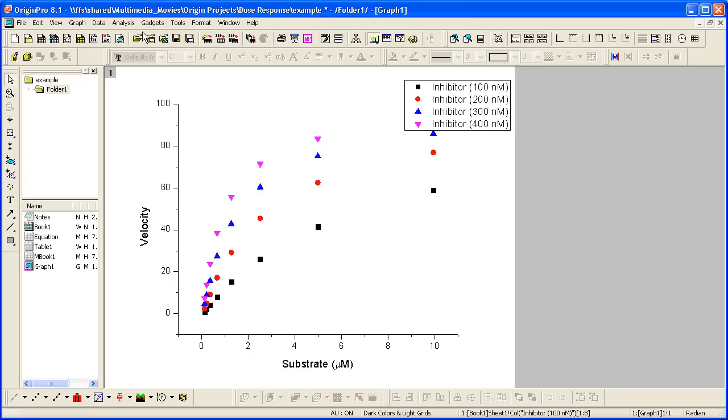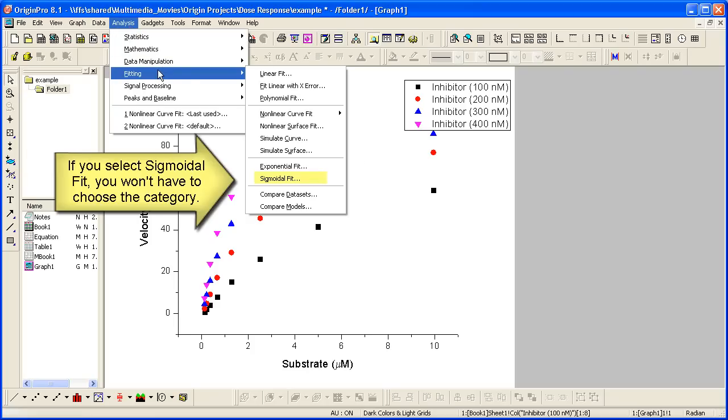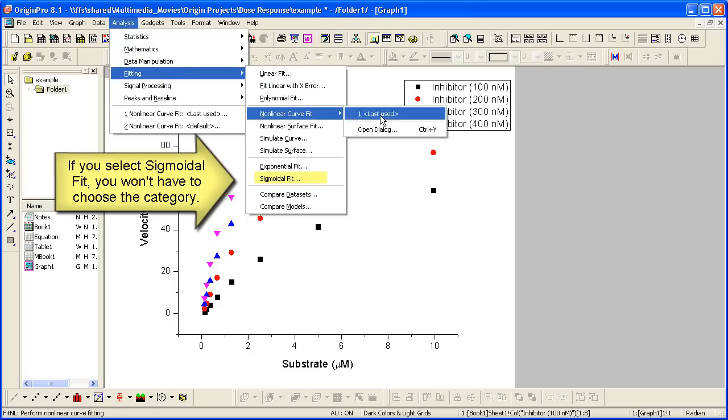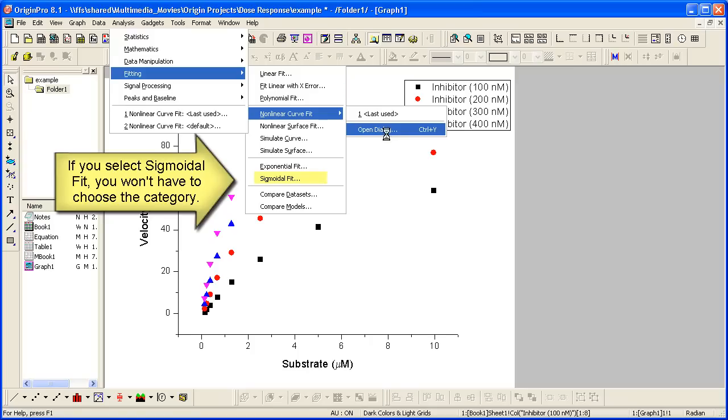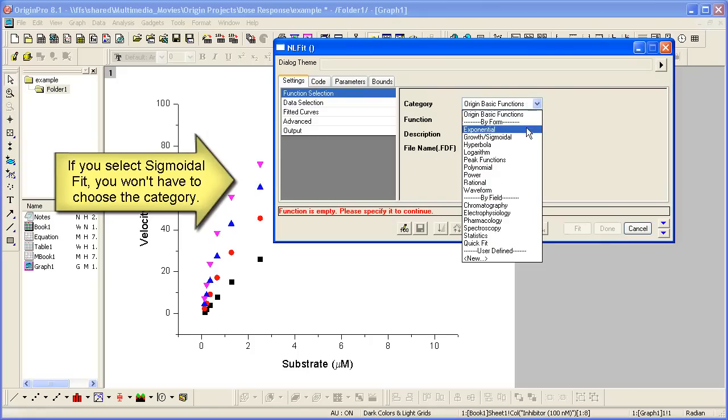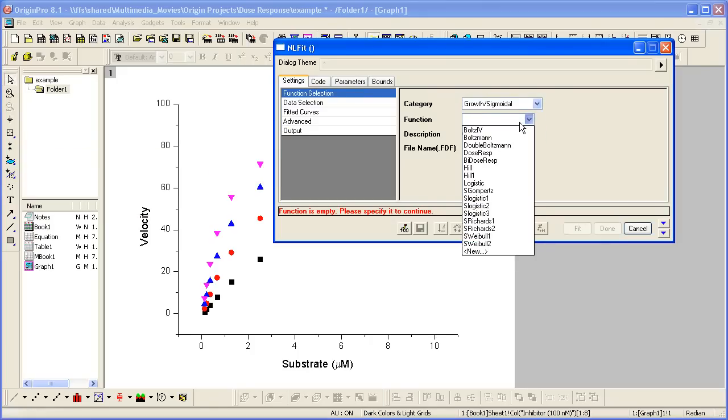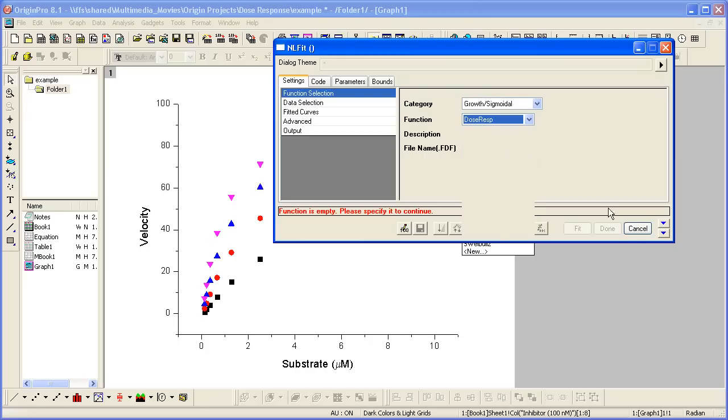Let's go ahead and bring up the curve fitter, analysis fitting non-linear curve fit. We'll take a look at the growth sigmoidal category, and let's look at the dose-response function.